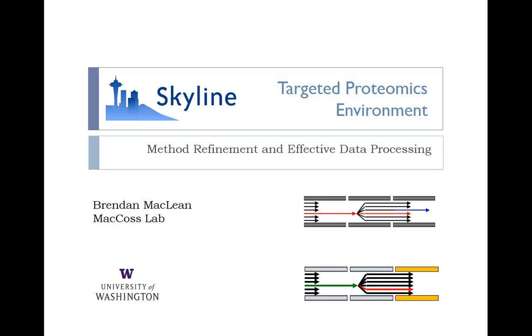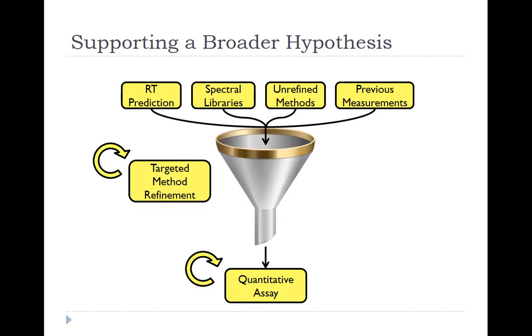So we're going to follow up on Sandy's talk and think a little bit more about method refinement. I'm going to start from a broad method. This is the slide I showed you yesterday, where we can take information to start and then put it into this targeted method refinement cycle.